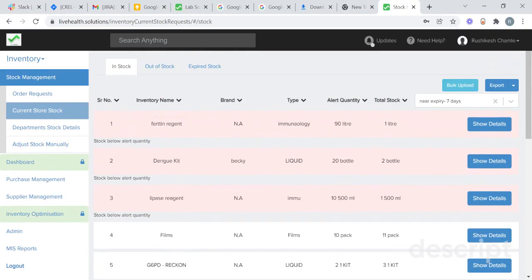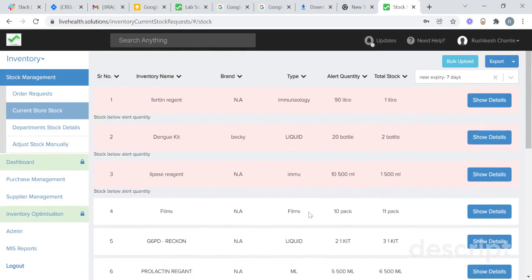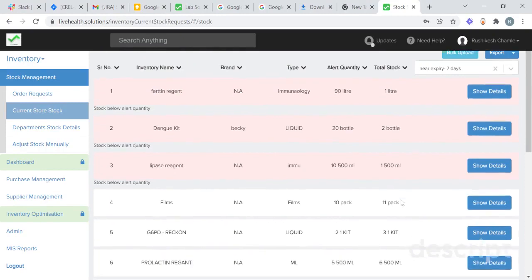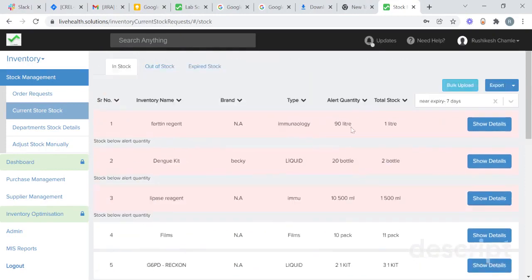You will get the name of the inventory, their type, alert quantity, and total present stocks. Alert quantity is the quantity which has been set so that when the stock goes below that particular quantity, it will be reflected in red color.